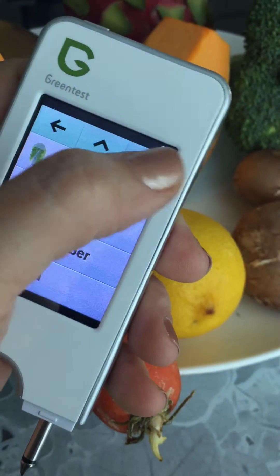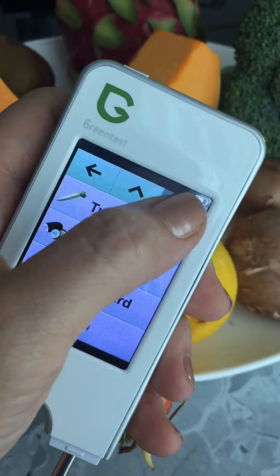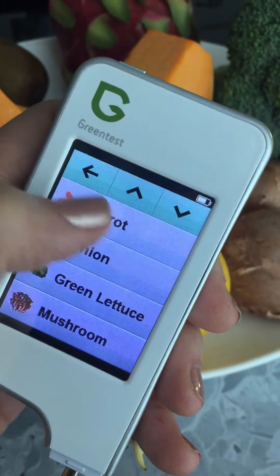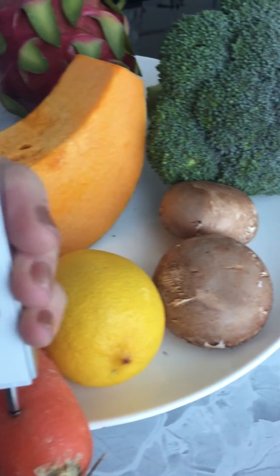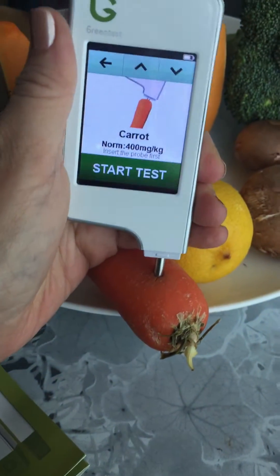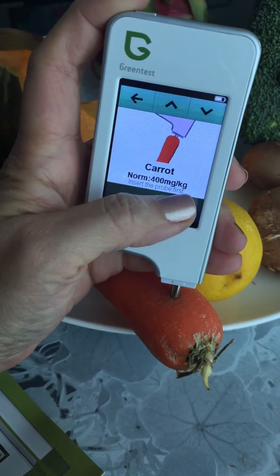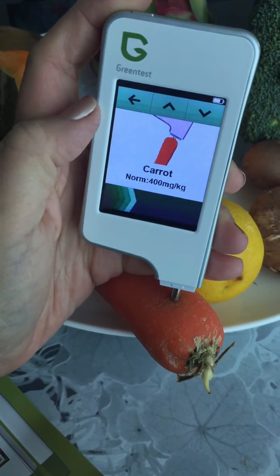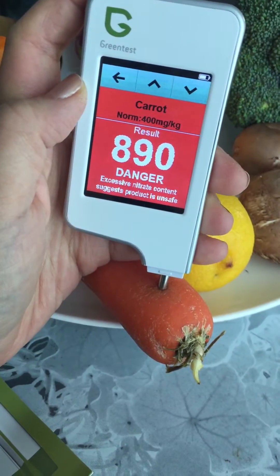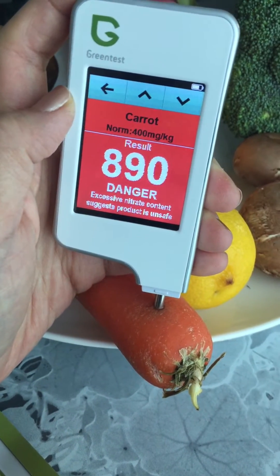Let's try carrots first. I'll select carrot on the device — there we go — and put the probe into the carrot. Sorry, attempting to do this one-handed, so bear with me. Put the probe into the carrot and then hit start.